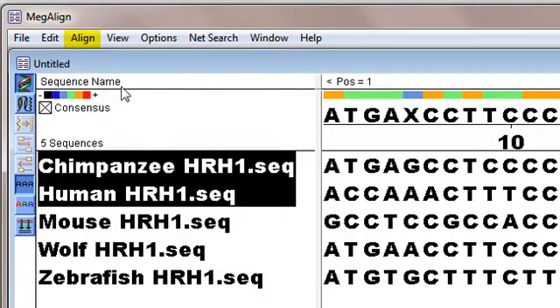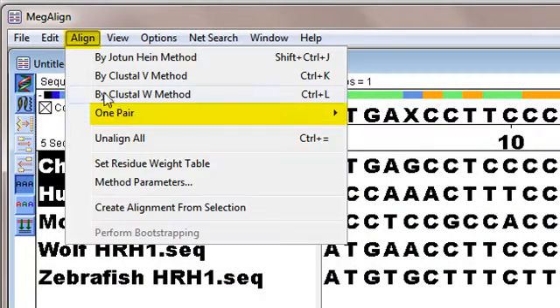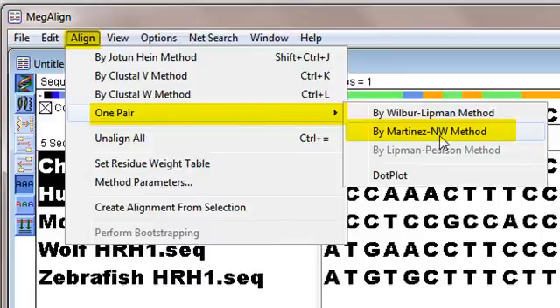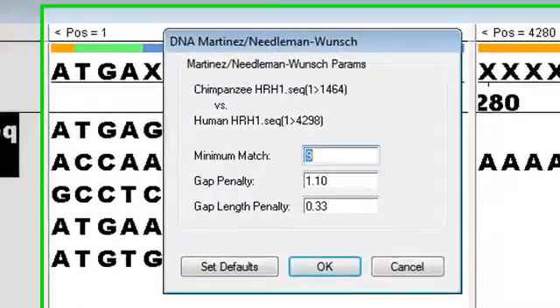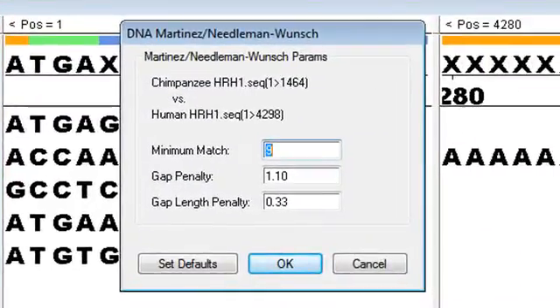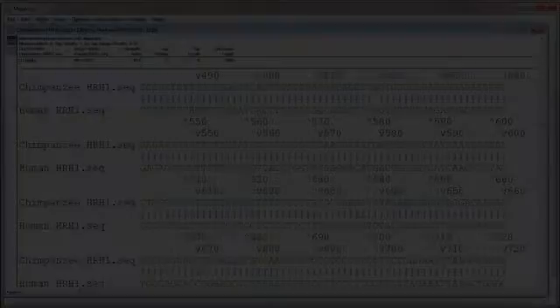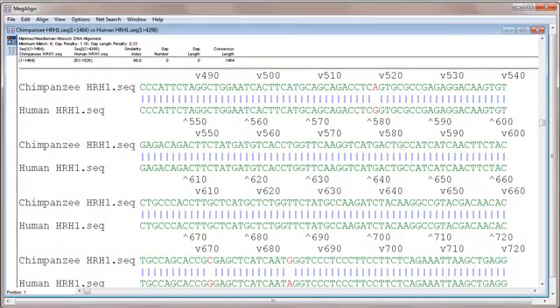After I go to Align One Pair by Martinez-Needleman-Wunsch method, the method parameters dialog opens automatically. In this case, I'll leave the parameters at their defaults and click OK to begin the alignment. And here's our finished pairwise alignment for DNA.